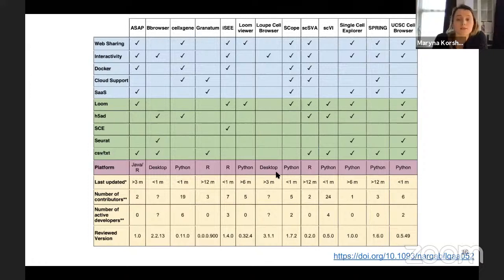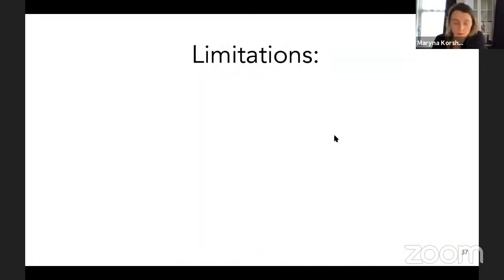And they're realized on different platforms, and also some technical details on the processing of this data set, how much it will take, and so on and so forth. So there are already a lot of tools developed, but still they have some restrictions. And which kind of limitation, to finish with this part, do interactive analysis tools have?